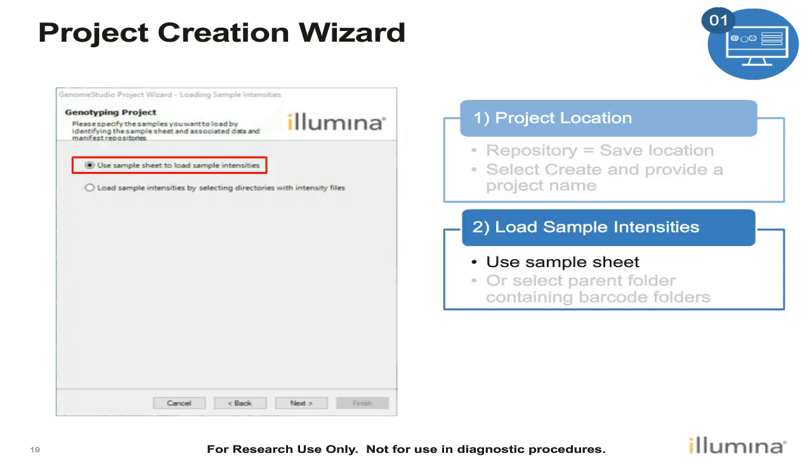Next, you'll be given two options of whether you want to use a sample sheet to load your data or whether you want to load intensities by selecting folders with intensity files. I'll go over the first option, which is using the sample sheet to load sample intensities.